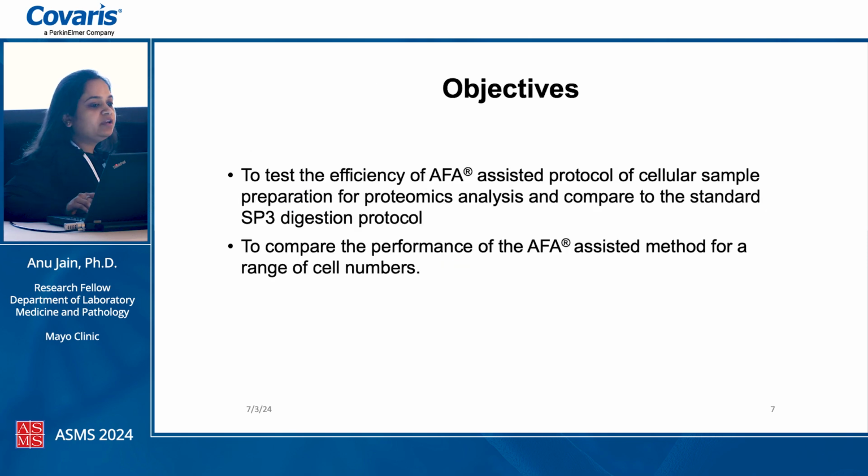So our objective here was to compare the standard SP3 digestion protocol that we were following to the AFA assisted protocol, and also to see how the AFA assisted protocol is performing across a range of cells starting from 1000 cells.